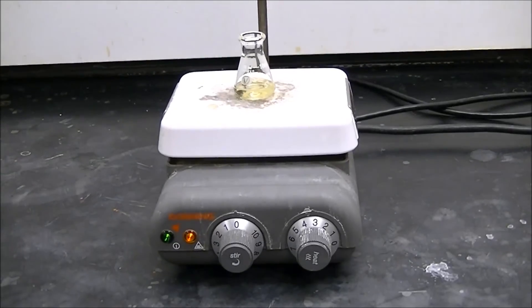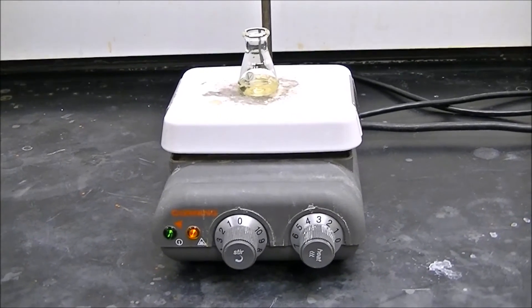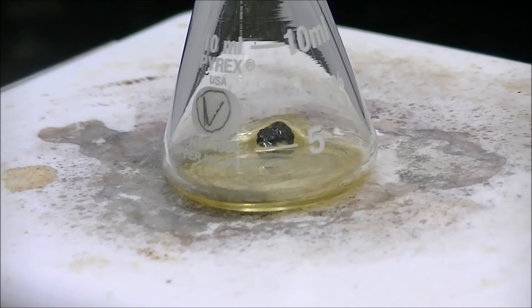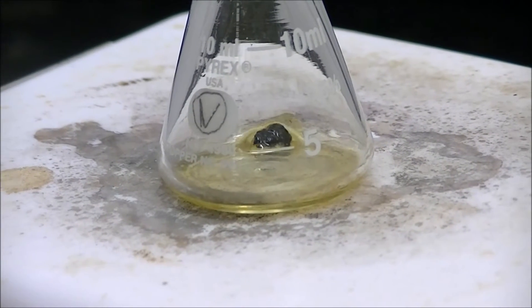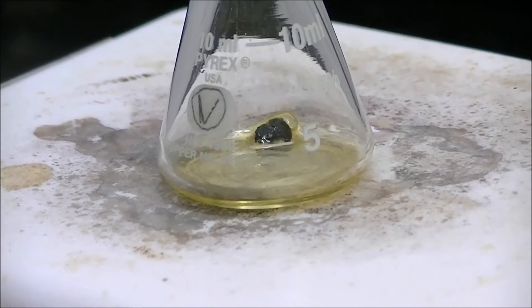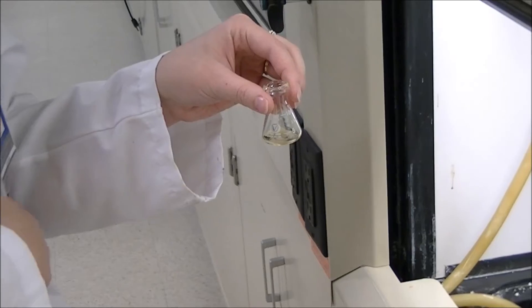Now boil off the diethyl ether. Note that the heat does not have to be very high. The lab says you'll have a yellow liquid left over after boiling. The boiling doesn't take very long. You know you're done when there are very few bubbles showing up on the boiling stone and the bottom of the flask is pretty warm to the touch.